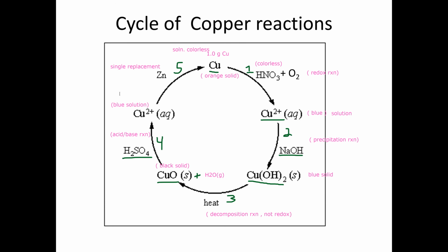These are things you should write in your lab notebook as you're doing these different steps. Now, if you start with 1 gram of copper and do all the steps correctly, in theory you should end with 1 gram of copper.